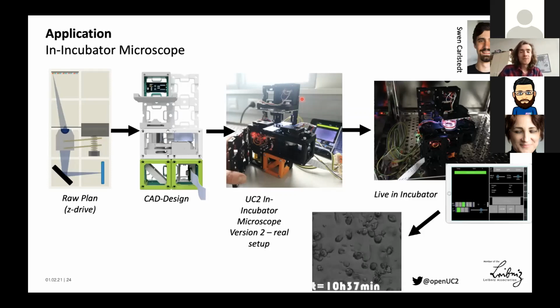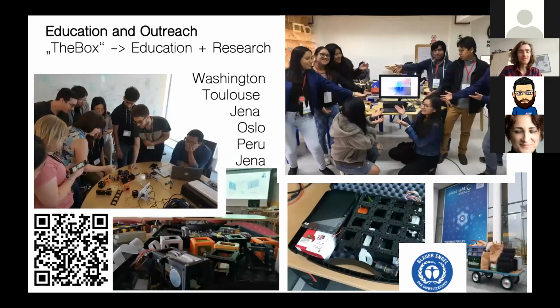And so one step further, we thought, okay, this is a nice tool not only for biologists, but also if you want to teach, for example, optics. So we took our bags, stuffed some cubes in there, and then we went to different locations and we're teaching Fourier optics, so everything what you probably know from Rainer Heinzmann's lectures. And it became really, really handy to teach, well, what is a Fourier transform, what's a Fourier filter, and how you can use it in order to make some fancy microscope out of it.